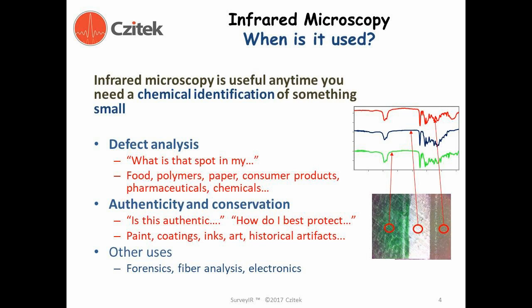Infrared microscopy. When is it used? When is it useful? With microspectroscopy, we have a very powerful system in that we can isolate areas of samples that we observe microscopically and target areas for infrared analysis. The image shown on the right-hand side of this slide pictorially represents this process. A sample with 3 different regions is observed. These regions, their contrast observed microscopically, can be targeted and infrared spectra recorded. The infrared spectra represent the chemical contrast of these regions.